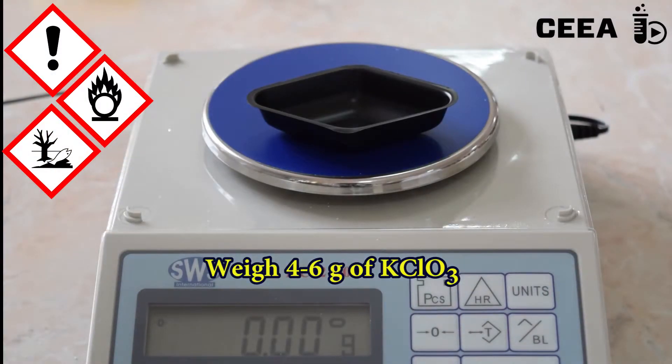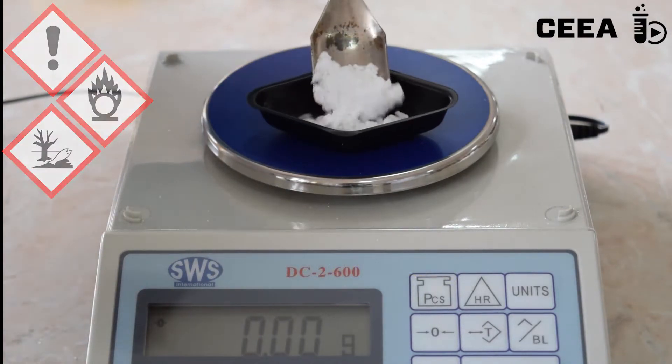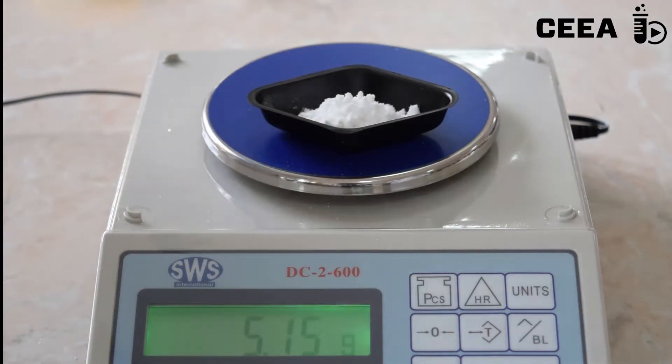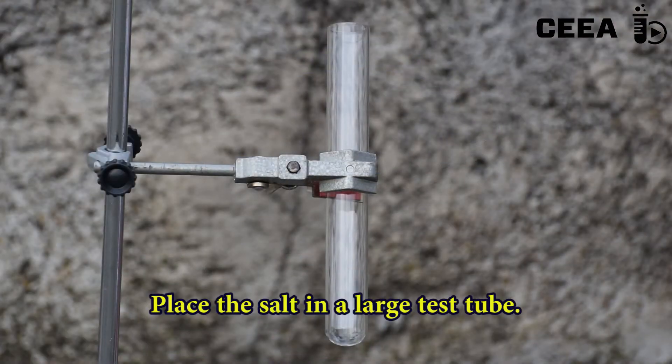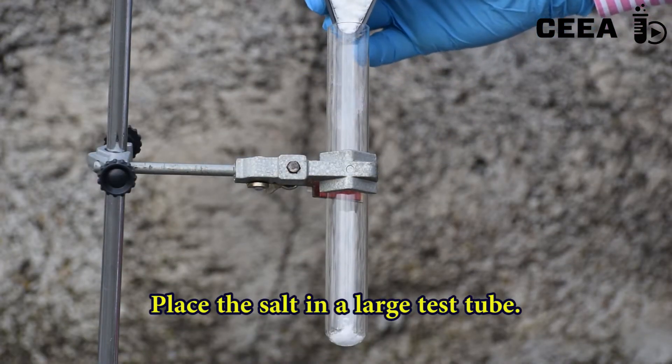Weigh 4–6 grams of potassium chlorate and place the weighed salt in a large test tube.